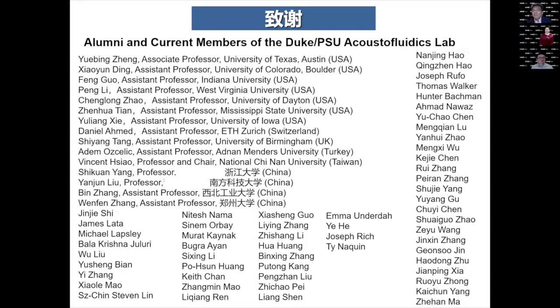Very good. So the next question is from Zhengfeng Yi of Peking University. Thank you, Tony, for your great talk. I noticed that the applications in your presentation are in vitro experiments on chips. How long will it take for acoustofluidics to be applied in vivo, such as blood vessels or tissues in the body? How to solve the influence induced by the change of the media from silicon and glass to tissues? For example, perhaps fat and body fluid with complex components will decrease the accuracy and the carrying capability of acoustofluidics.